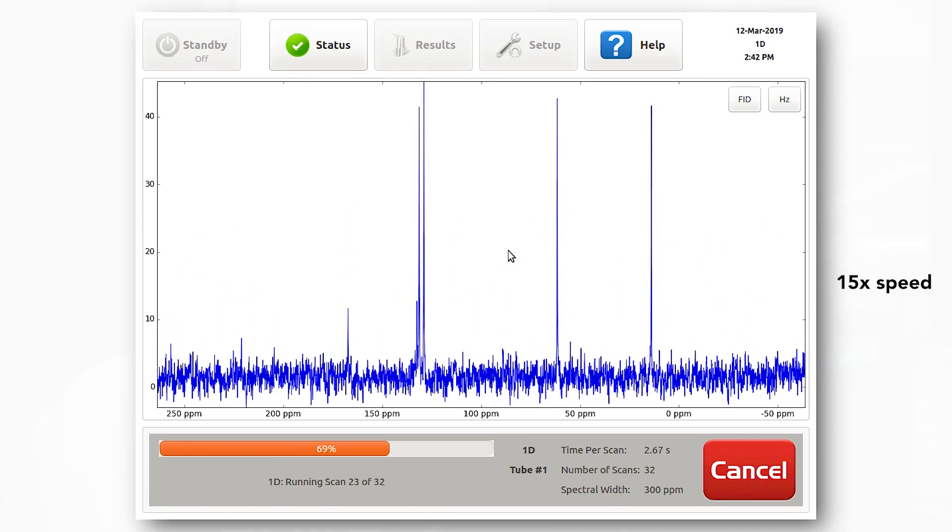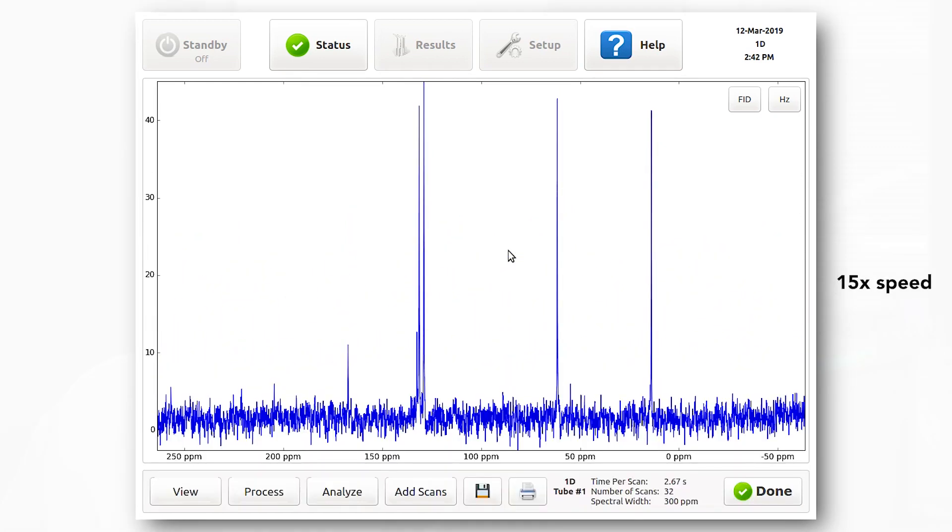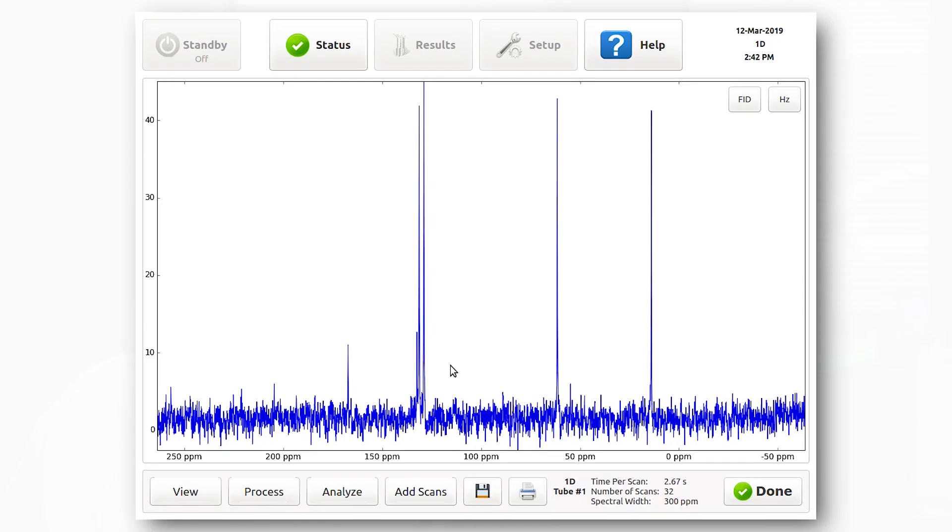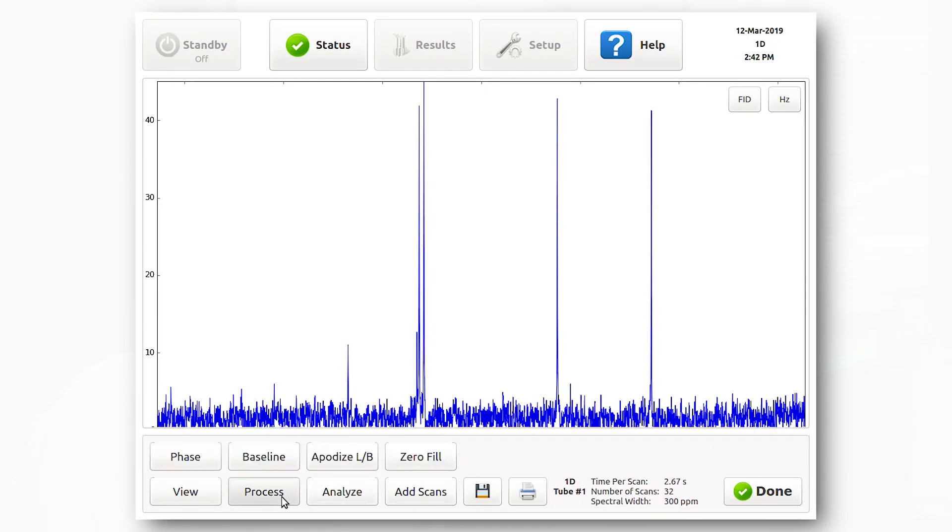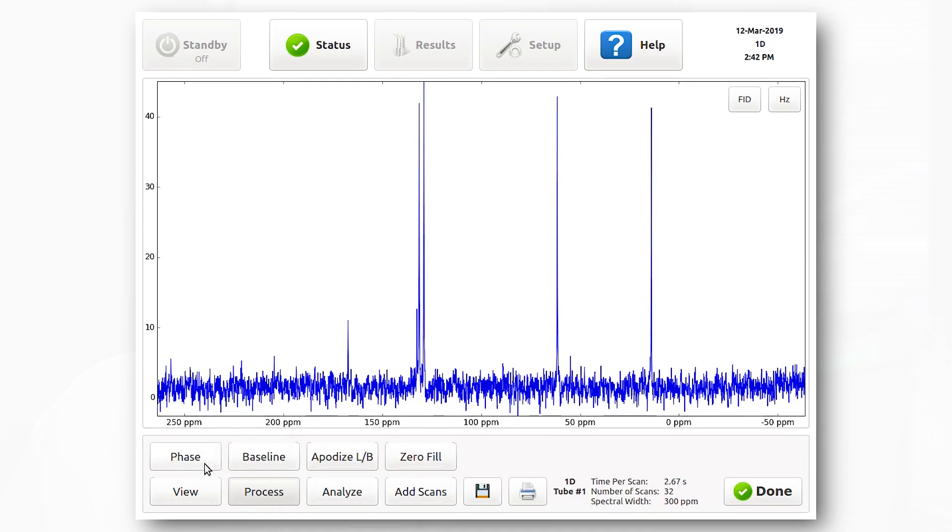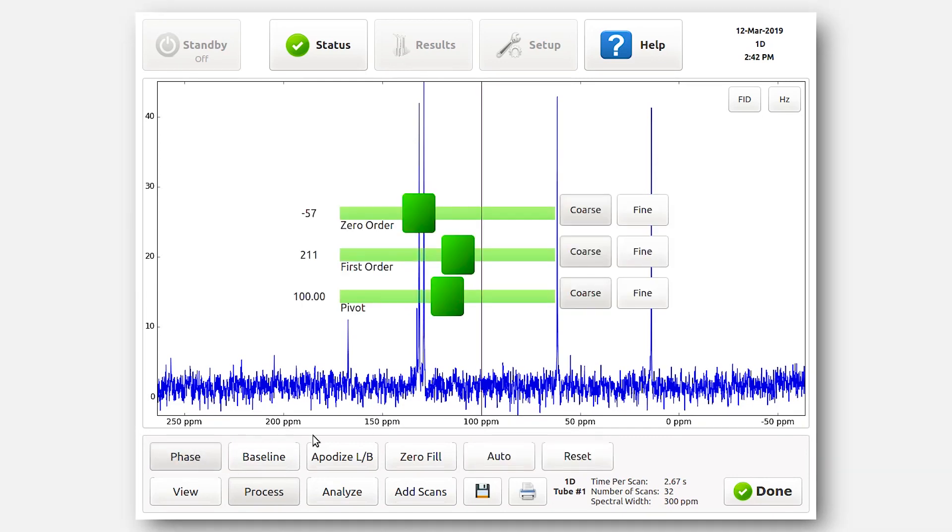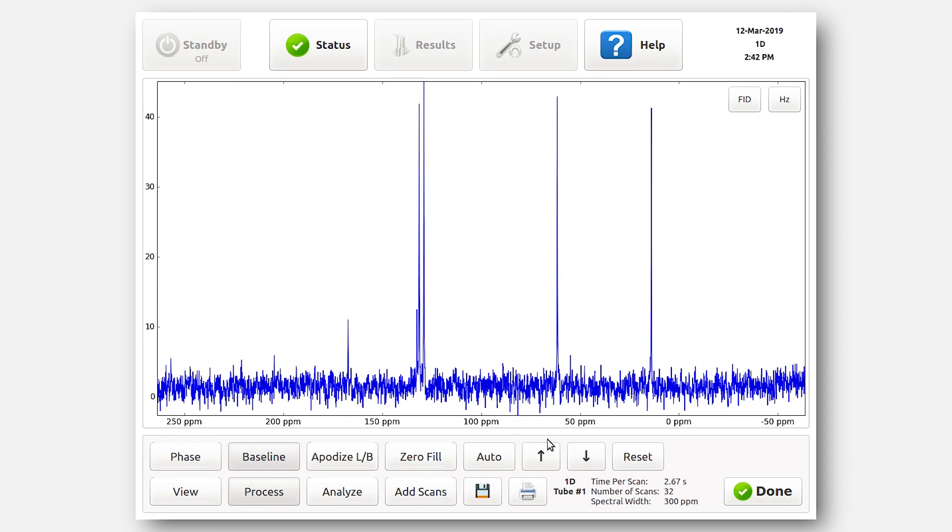When the experiment is finished, you can add more scans if necessary or process the data. Right now, we're going to do an automatic phase and baseline correction. At this point, I will save the data file. The file format for this is a JCAMP-DX file which can be opened up on any processing software, such as MNova, ACD Labs, and Topspin.